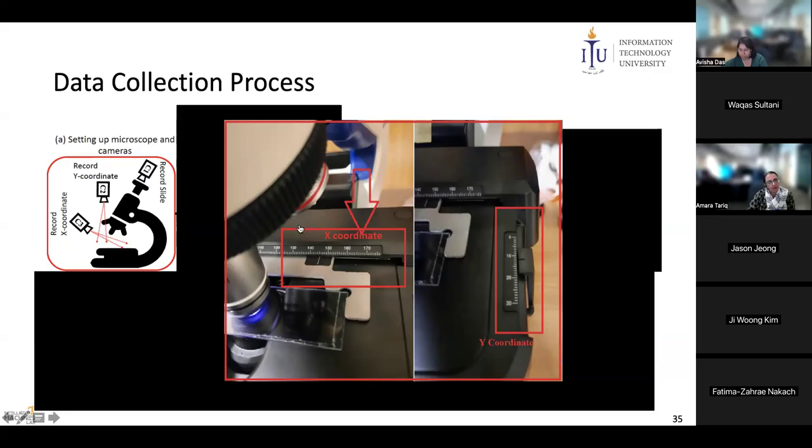So when the doctor was finding the malaria and said, okay, I found that malaria cell, you can take the picture, we press the button and take 3 pictures at a time, one picture of the actual image, and one picture of these coordinates.